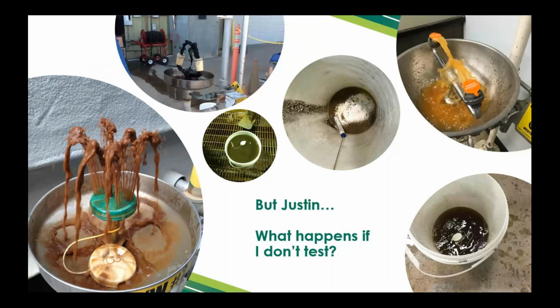Okay, and this is what we want to avoid. It's the chocolate wedding fountain. I'm pretty sure that's concentrated evil up there in the top left, or they struck oil. I'm not sure which. That Guardian's pumping out Gatorade. You've got coffee in the bottom right. We want to avoid this. This is nasty. This is potential Legionella. This is an exciting new lung disease you're going to take home that you don't want. So please clear out those dead legs, test on a weekly basis, and ensure we have clean flushing fluid.